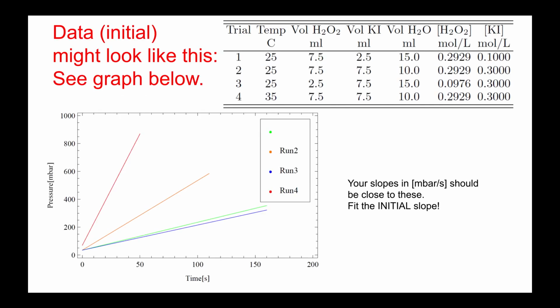Okay. So, my word run 1 did not want to appear. Oh well. Okay, so again, this is the experimental data. So, the values we will enter. Okay, so this is examples of your data.